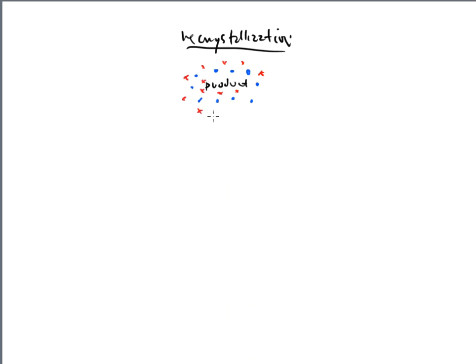But you're going to say, well, where do the impurities come from? How do I know that I'm going to have impurities? You're always going to have impurities. Okay, that's just the way that it's going to be. And the reason is because in the production of this product, you have used more than one thing to make the product with. And very often byproducts could happen in these reactions.